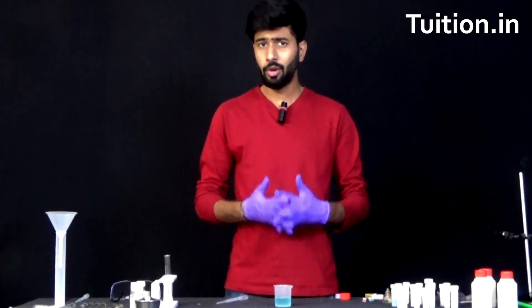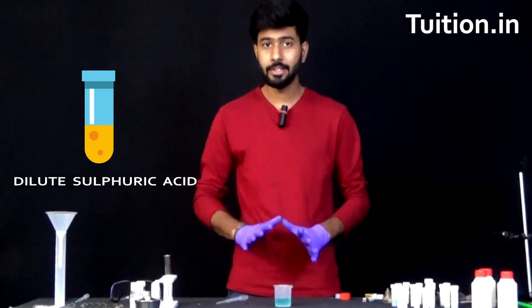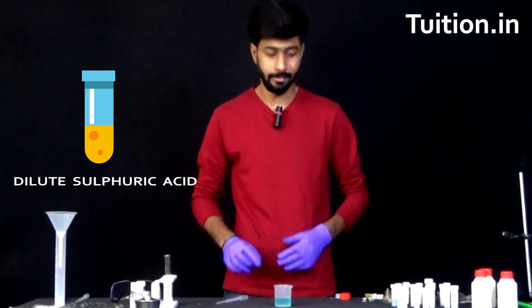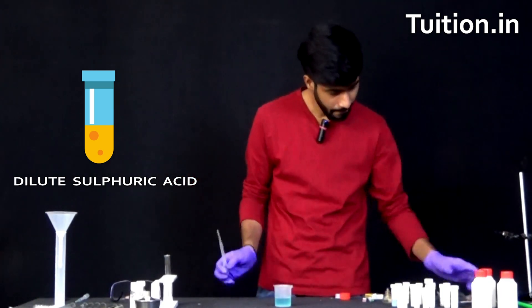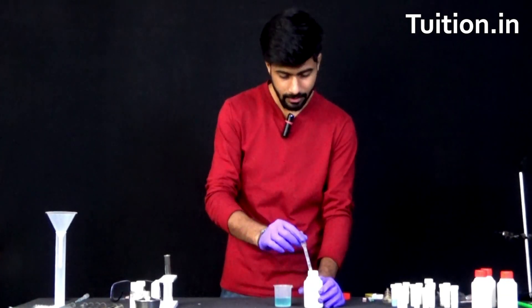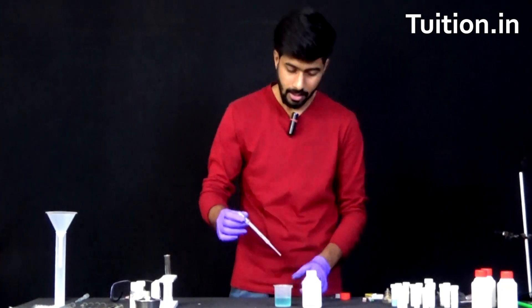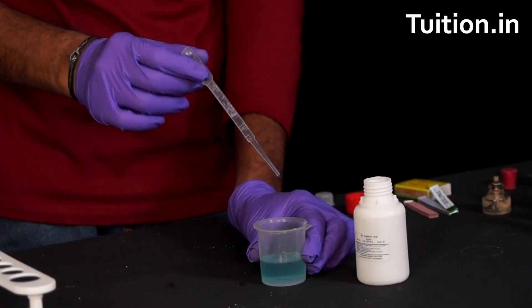Next we will take 4 to 5 drops of dilute sulphuric acid and pour it in this beaker. This is going to help the reaction to occur. Be very careful while handling sulphuric acids or hydrochloric acids.